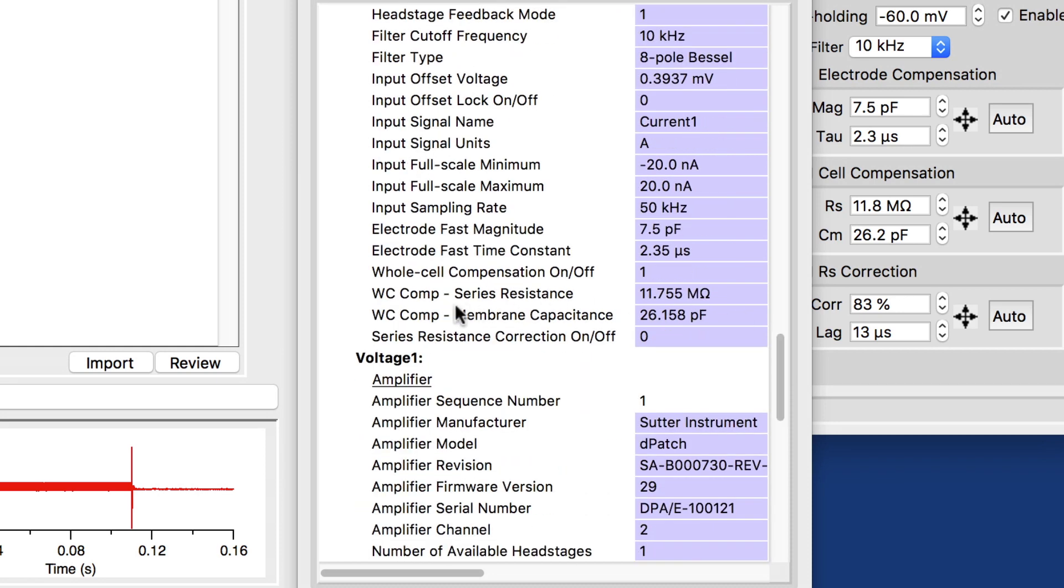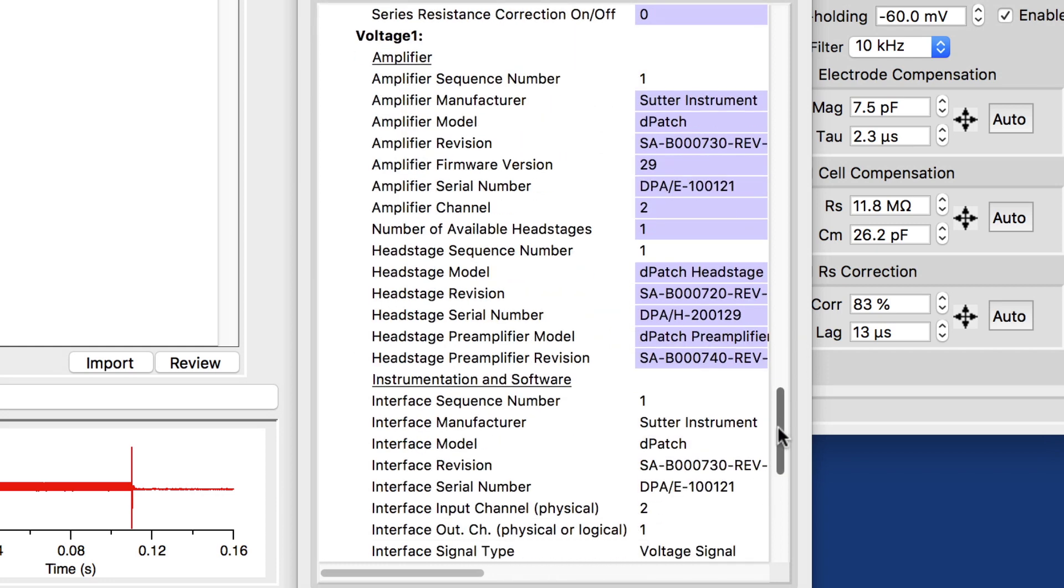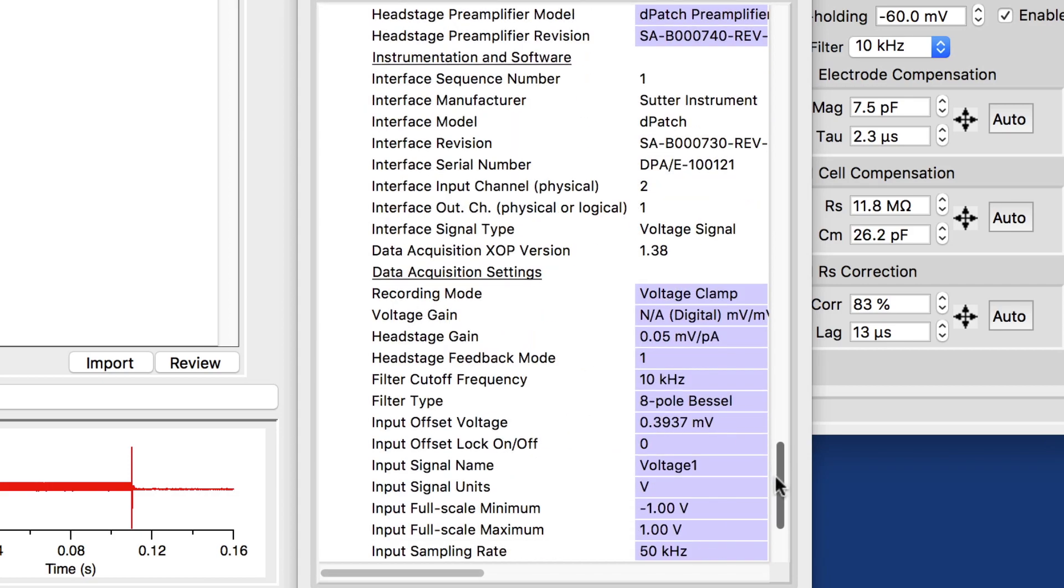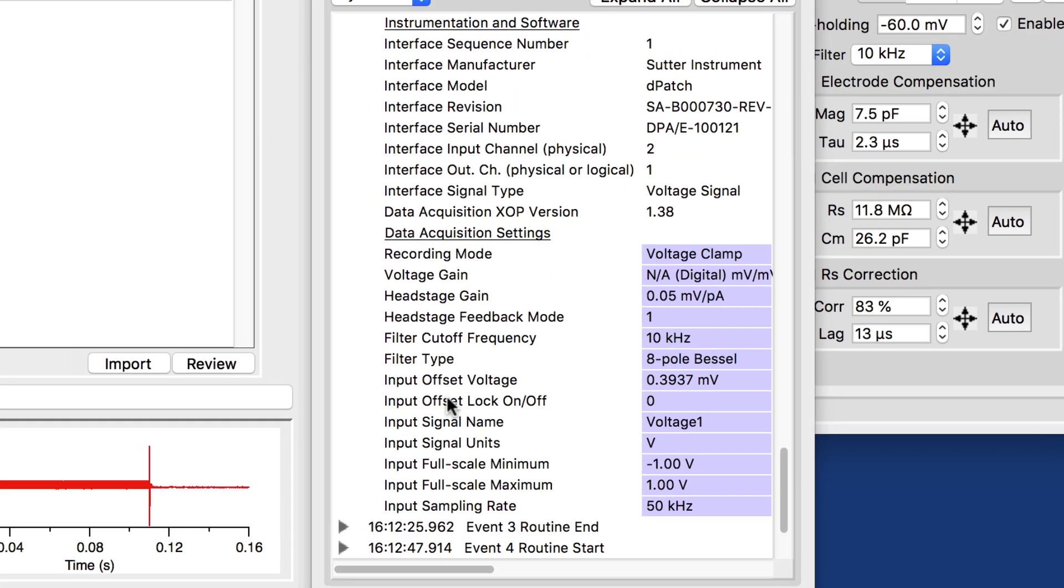But we have the series resistance, the membrane capacitance, all the values that were stored when I last closed the membrane test. And that all gets automatically determined.